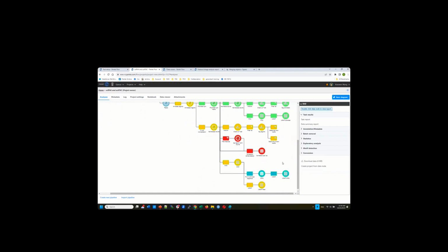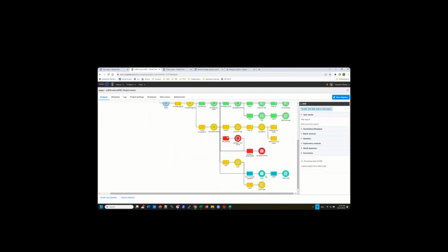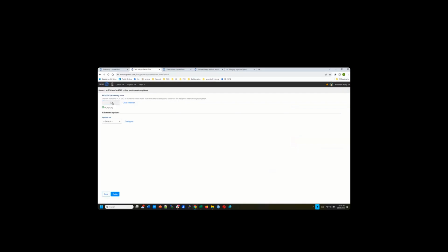Another thing is, when we learn single-cell multiome, you can visualize the different assays by combining them together. The method we used is WNN, multimodal neighbors. This task requires you to click the combine PCA data node or SVD data node. If I choose the ATAC SVD data node and go to find multimodal neighbors, you need to choose another one.